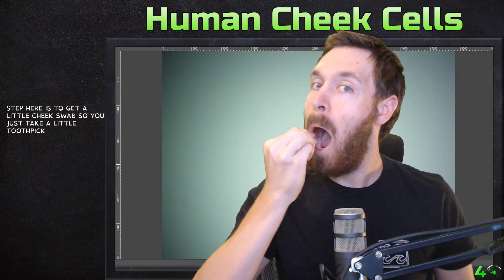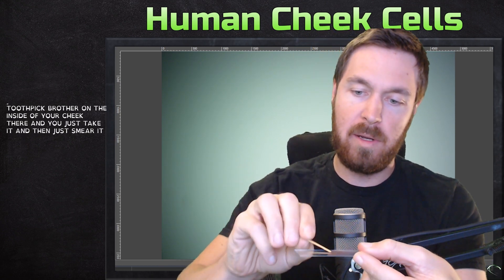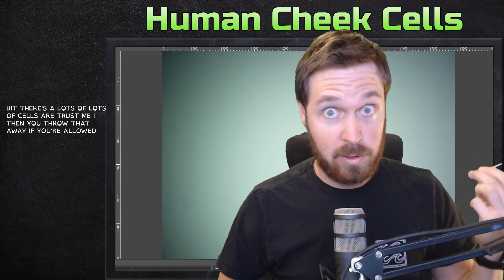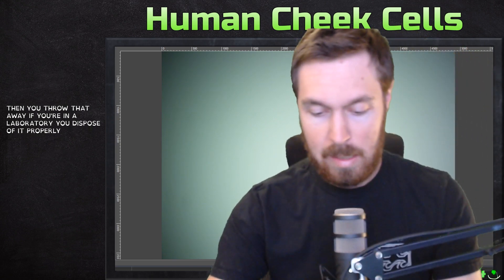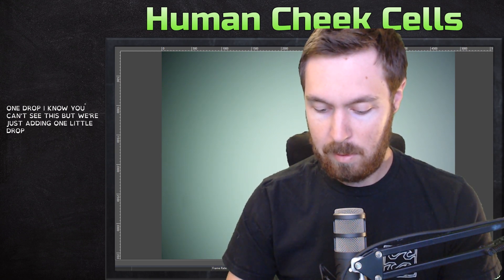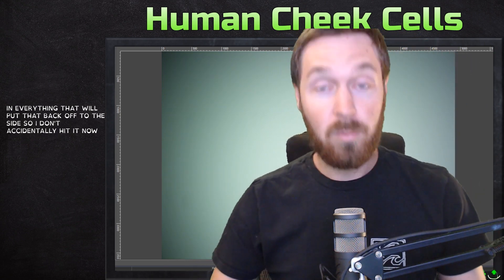First step: take a toothpick, rub it on the inside of your cheek, then smear it on the slide just a little bit. There are lots of cells there, trust me. Then throw that away — if you're in a laboratory, dispose of it properly. Next, we add just one drop of methylene blue. Not much. Be careful, you don't want to get it everywhere — it will stain everything. Put it off to the side so I don't accidentally knock it. This methylene blue is currently staining my cheek cells.